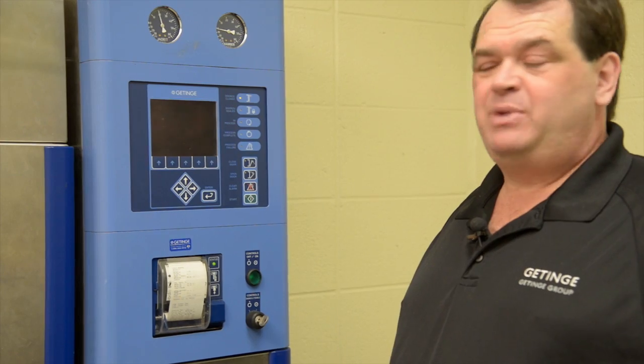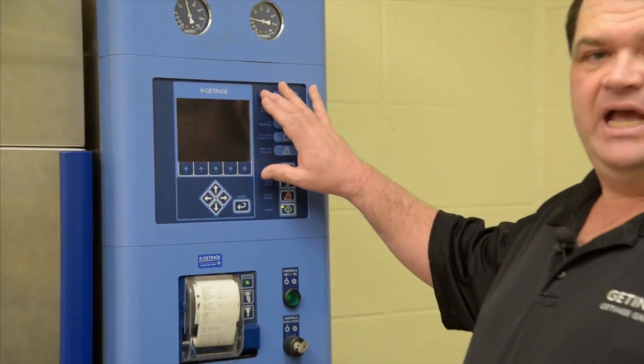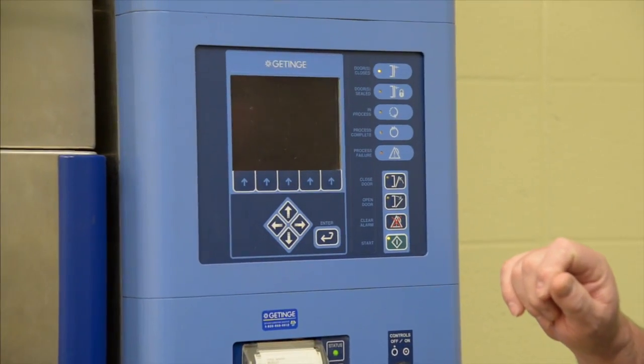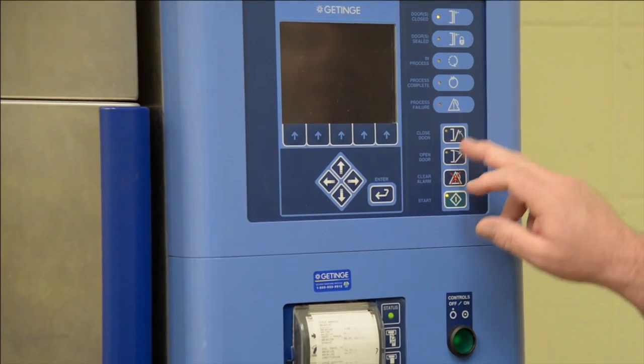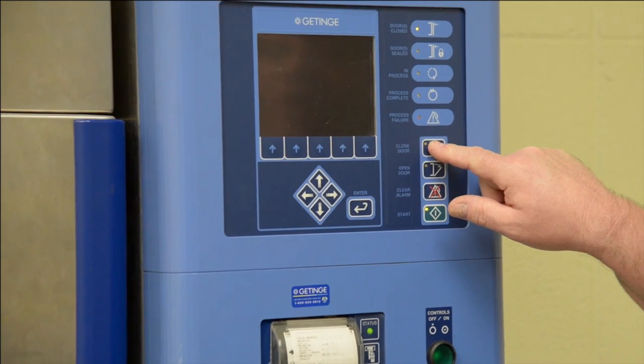Please see your department head or instructor for proper safety equipment to be worn during the operation of this machine. Our sterilizer displays come with a screen saver where the screen powers down for the display. To restore the function of the unit, simply press any of the operation buttons and the screen will light back up.